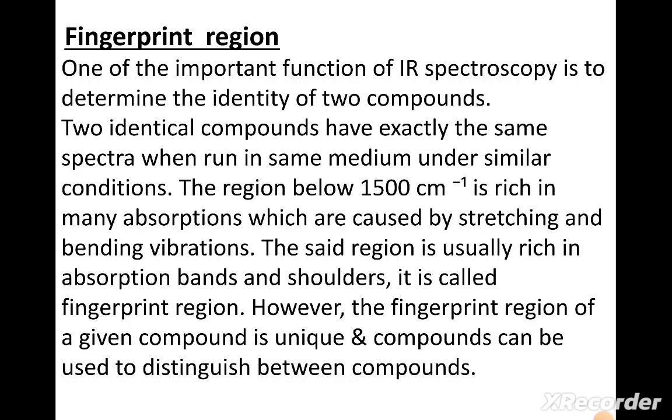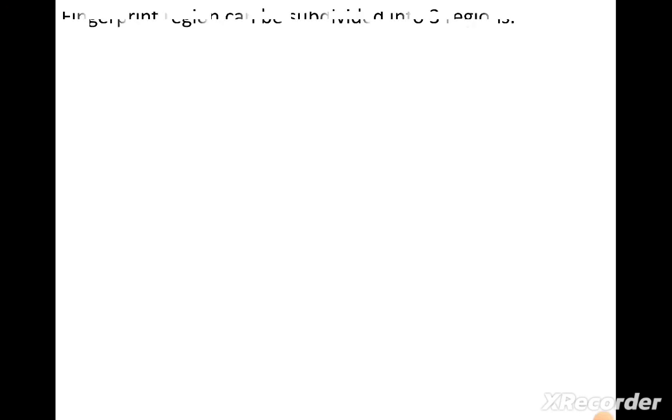And the fingerprint region can be used to distinguish between compounds. Through this fingerprint region, we can identify two compounds. The fingerprint region can be subdivided into three regions.